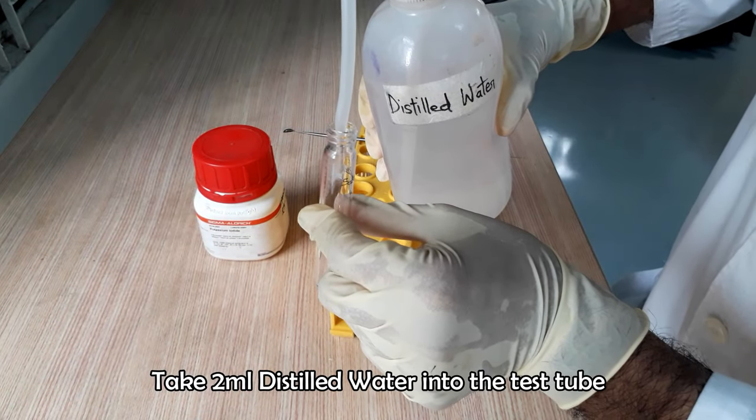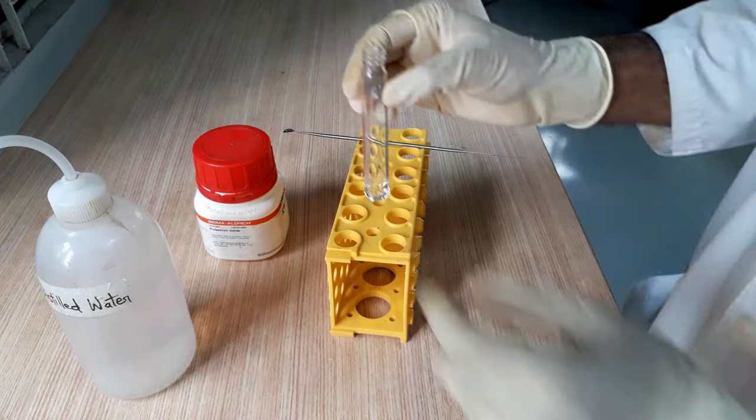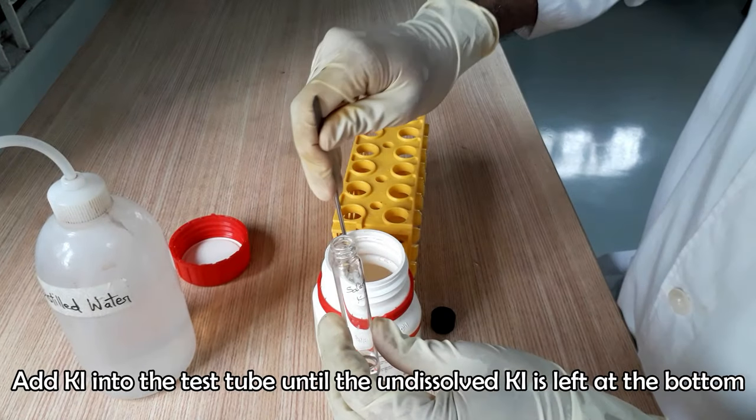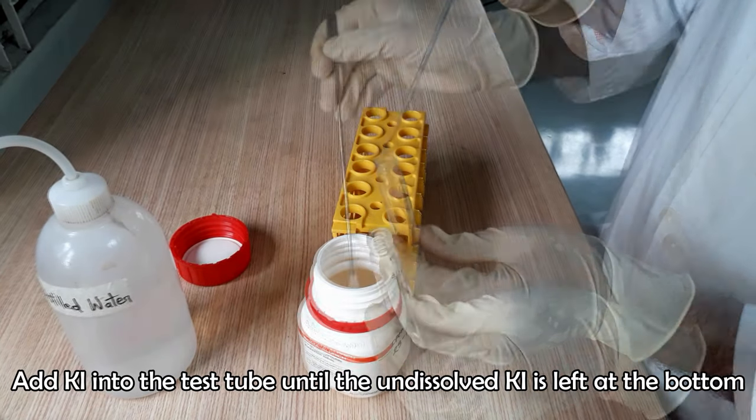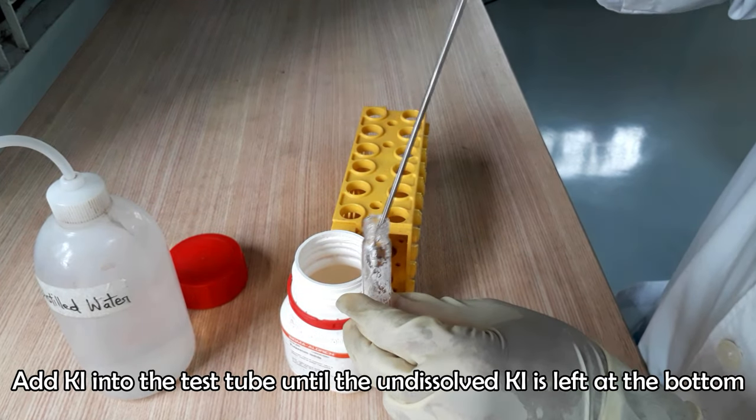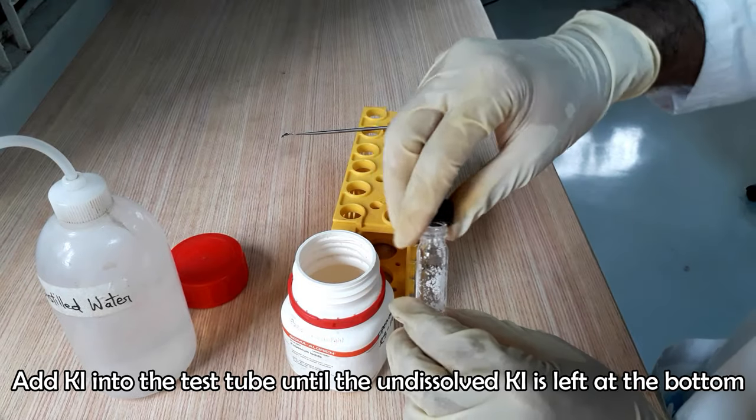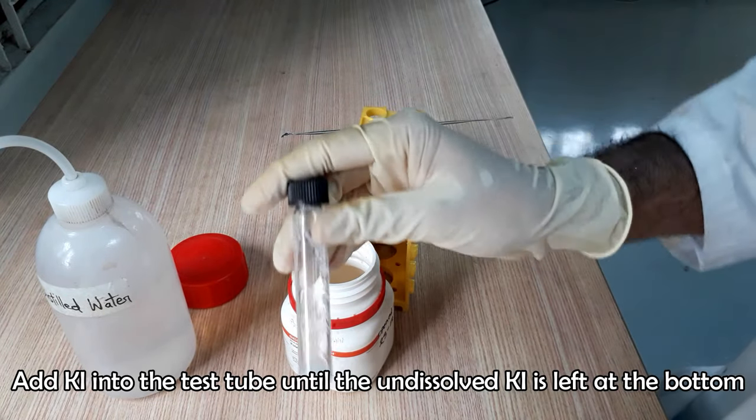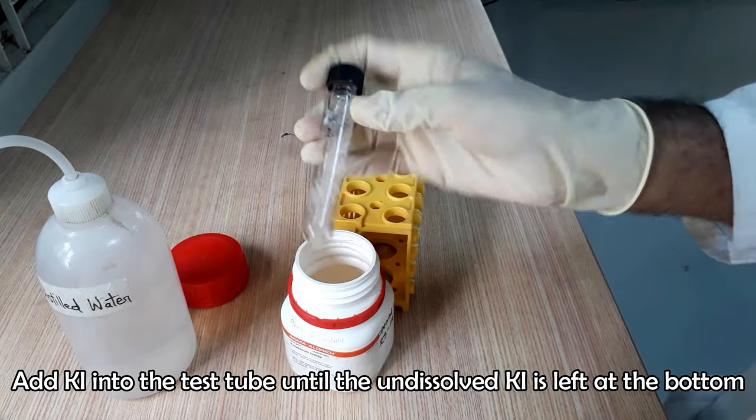Take 2 ml of distilled water in a pre-labeled glass test tube. Add potassium iodide crystal by a spatula and shake to dissolve the potassium iodide in water. Continue adding potassium iodide until the sediment of the potassium iodide is left in the bottom of the test tube.